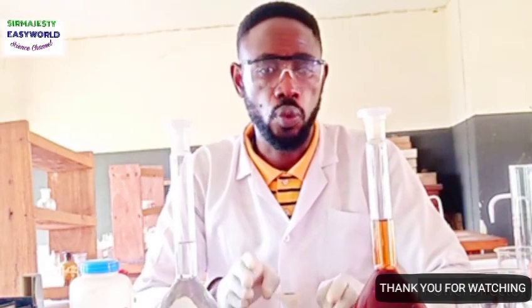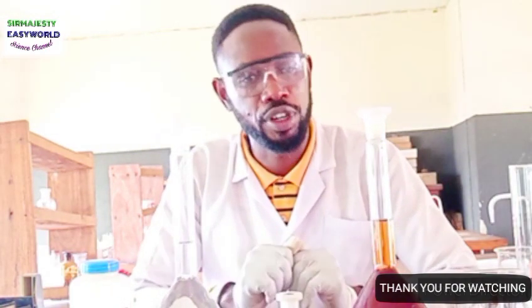We are done with this method of preparation of standard solutions according to specification.